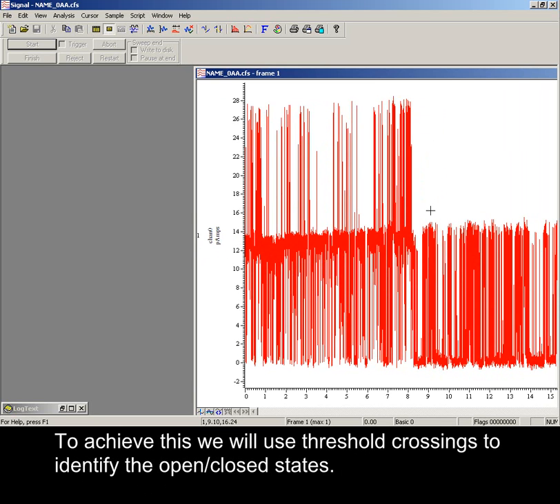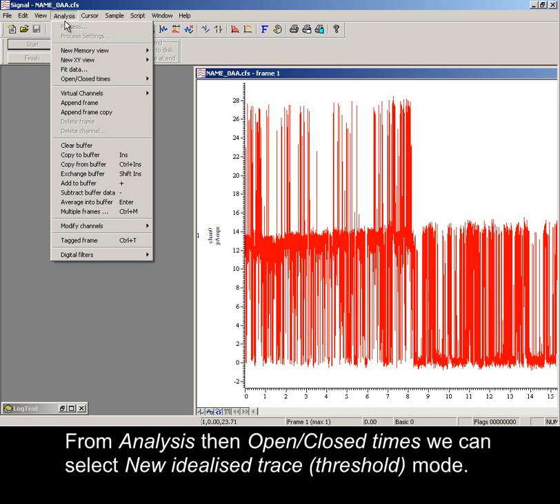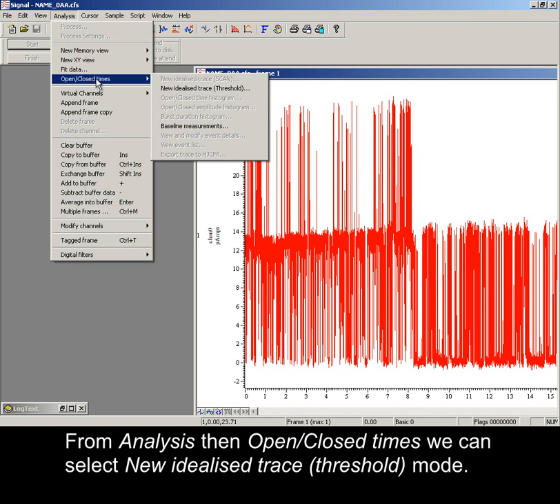To achieve this, we will use threshold crossings to identify the open-closed states. From Analysis, then Open-Closed Times, we can select New Idealized Trace Threshold Mode.